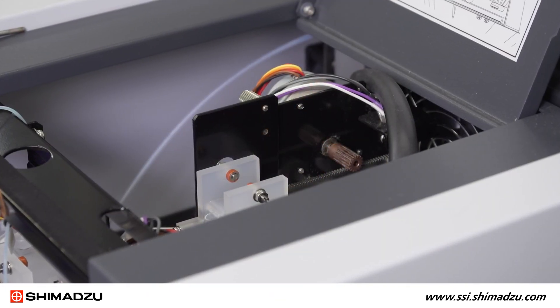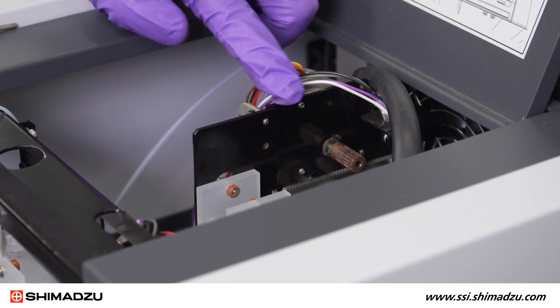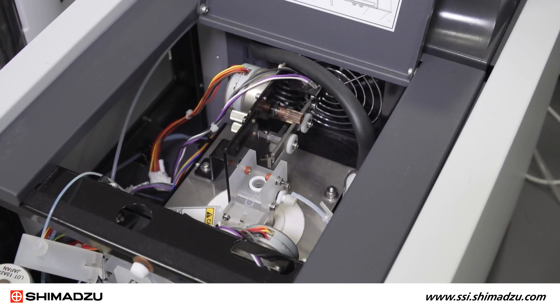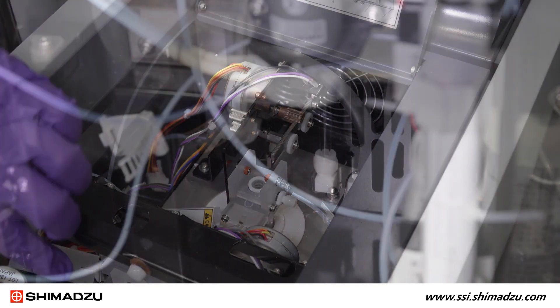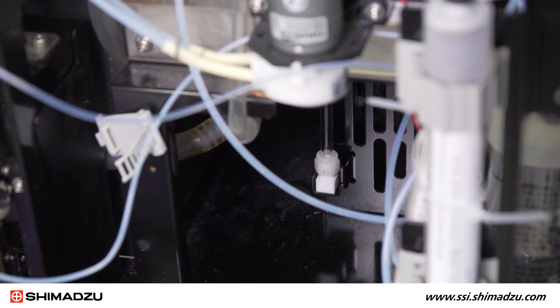Align the top of the black bracket on the injection block with the black plate to ensure that the position of the assembly is correct before you tighten any screws. Once you confirm proper alignment, tighten the two injector retaining screws. Next, tighten the fitting at the bottom of the combustion tube where it connects to the cooling coil.